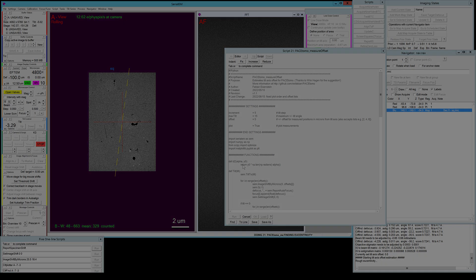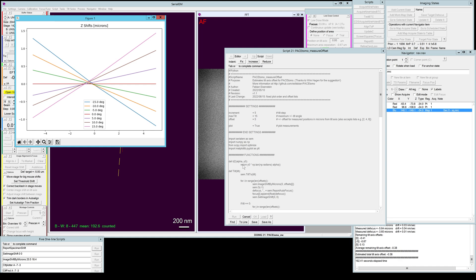Alright, once it is done it will pop up this little figure here showing you the overlap, which gives you a rough idea of how precise the estimate is. But you also get the actual output down here in the log window, so the value varies a bit depending on the offset but the overall value is about minus 0.4.